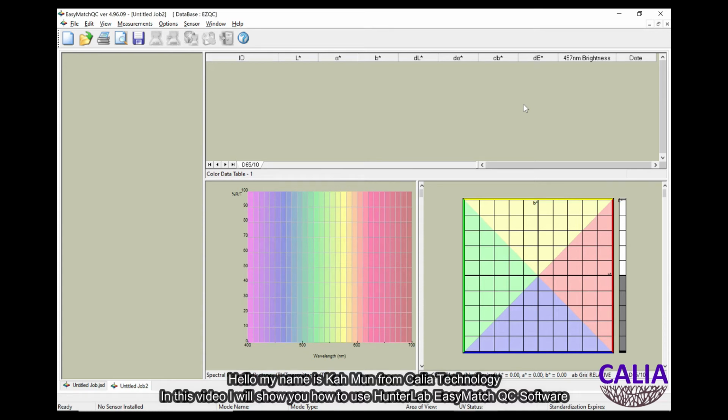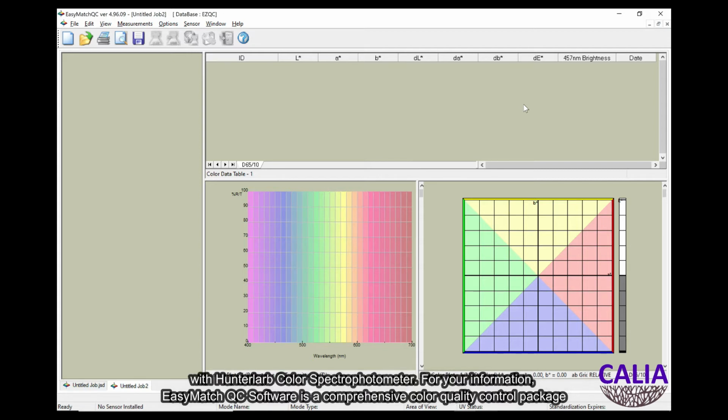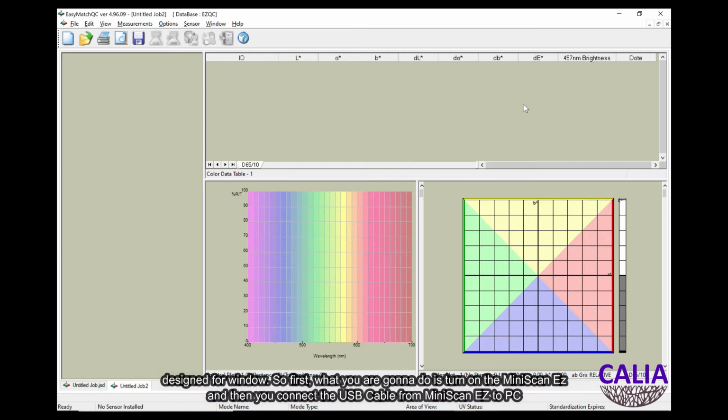In this video, I will show you how to use HunterLab EasyMatch QC software with HunterLab Color Spectrophotometer. For your information, EasyMatch QC software is a comprehensive color quality control package designed for Windows.